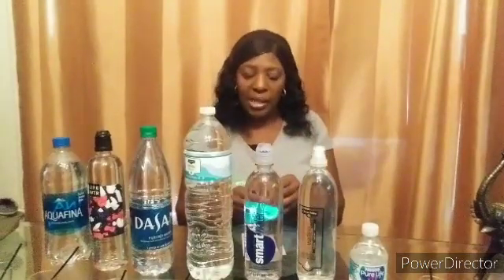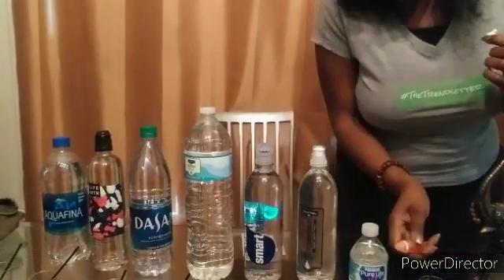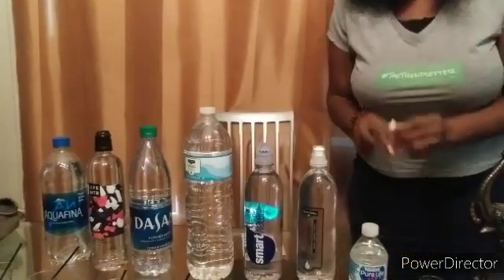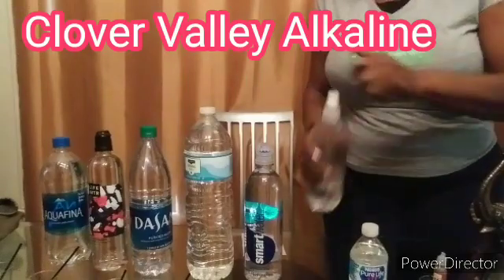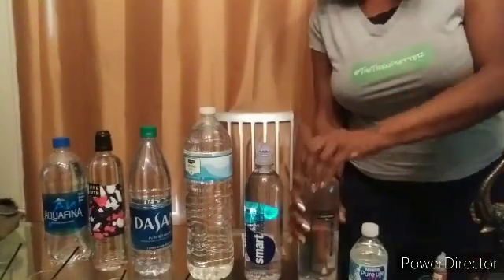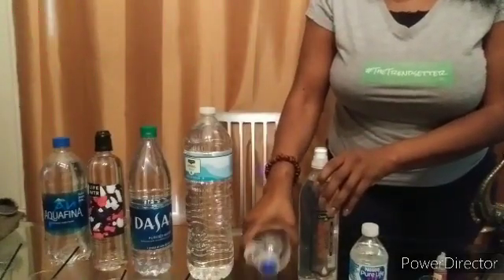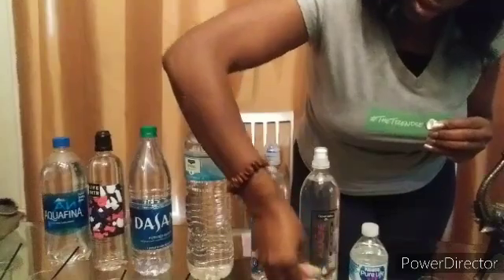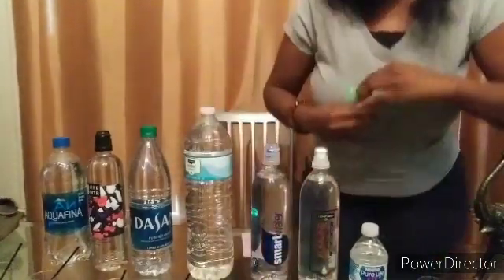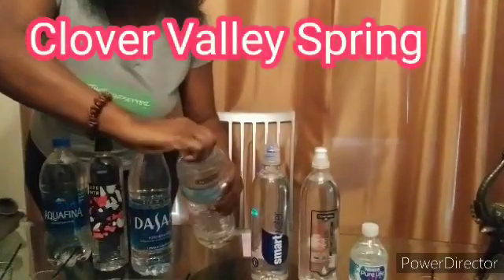I'm going to open my balance drops and give each one two drops. This is the regular tap water - one, two - and this is the Nestle - one, two. This one here is the supposed-to-be alkaline water from Clover Valley; I'll pour that there. This one here is Smart Water - let's see how that does. Two drops: one, two. Let's see how those do and we'll move on. This one here is spring water, also from Clover Valley.